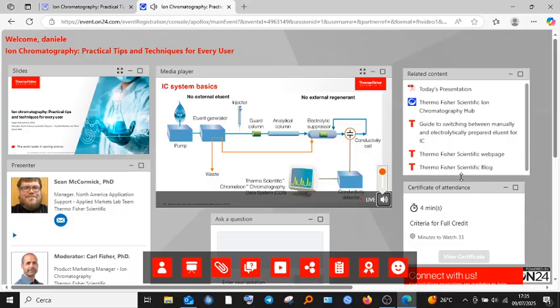After the different components of the sample are separated, they are passed on to a suppressor. And in this example, we're using electrolytic suppression. The suppressor's job is to remove the eluent from the flow. The eluent in this case is a salt solution. It's potassium hydroxide in most cases. We must remove the potassium and neutralize the hydroxide in order to minimize our background.